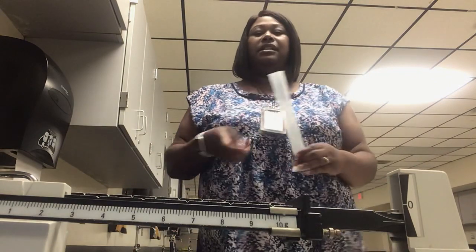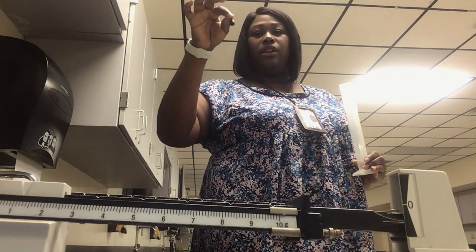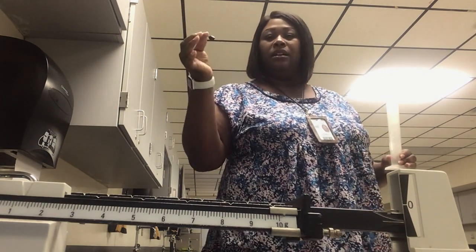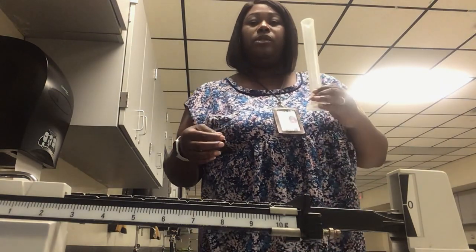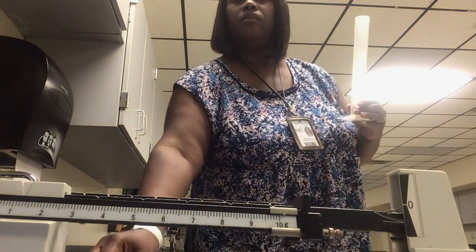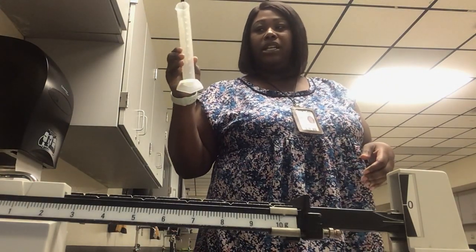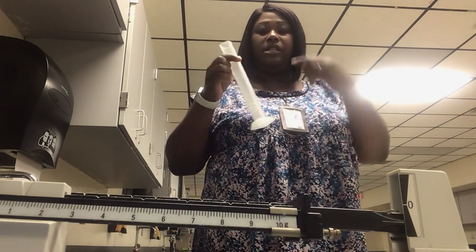So if you have your notebook, you're going to write mass for this irregular shaped item is roughly about 10 grams. Now, because it is an irregular shaped item, we can't get a ruler and do like you would typically do in math if you had a length times width times height problem. So the way we do this is we take our graduated cylinder. You can put a select amount of water in here, not too much, because you have to drop this in and of course it's going to increase in volume.